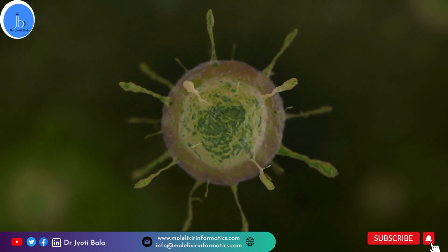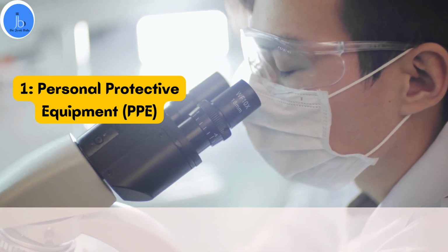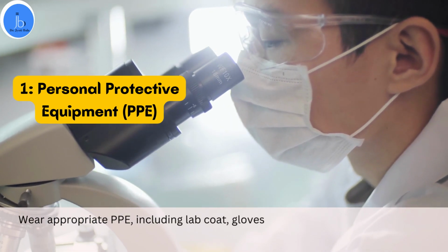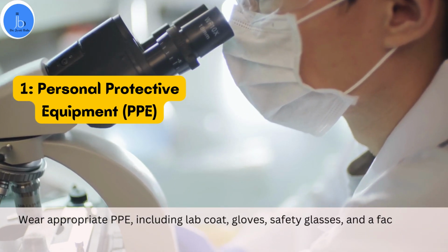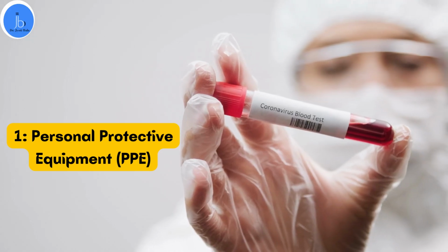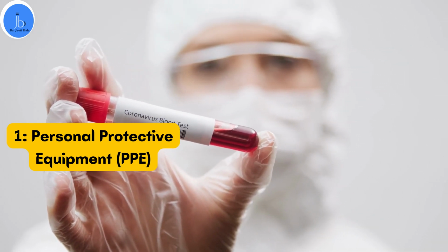The number one is PPE, the personal protective equipment. Always prioritize your safety by wearing the appropriate personal protective equipment. This includes lab coat, gloves, safety glasses, and face mask when necessary. Make sure your PPE fits well and is in good condition to provide adequate protection.